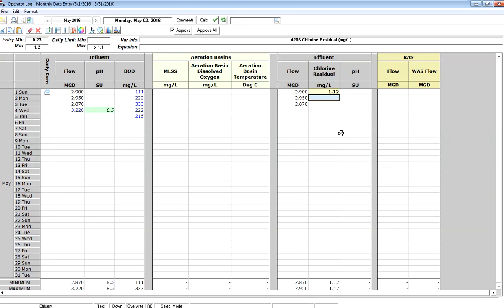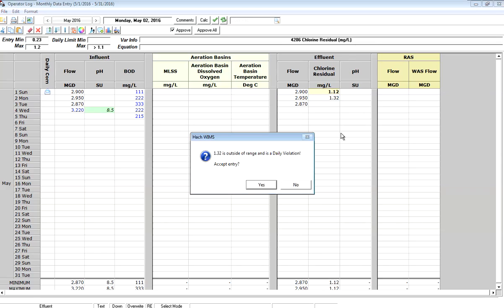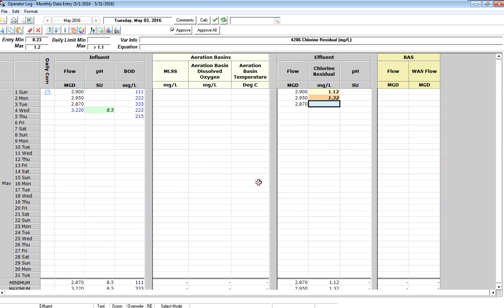If I type a number that's outside of both ranges, in this case 1.32, it's going to come up and say it's outside of the range and is a daily violation. If I accept it, it becomes this light orange background color.